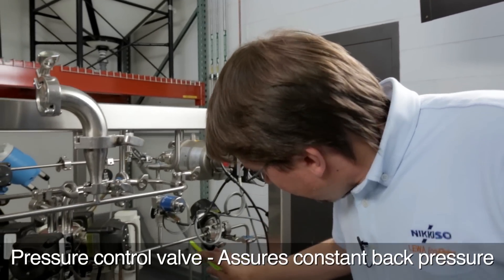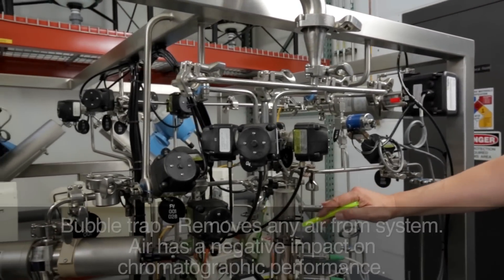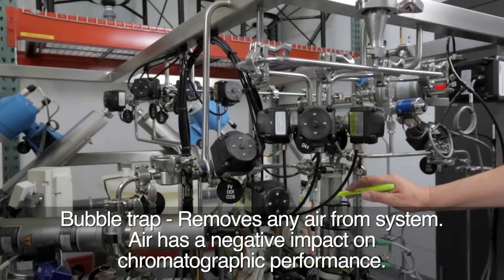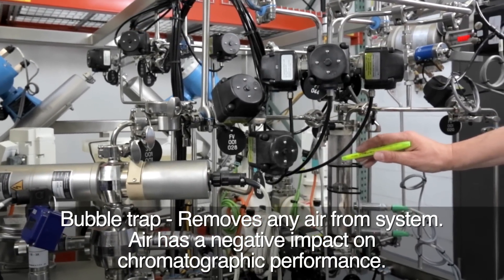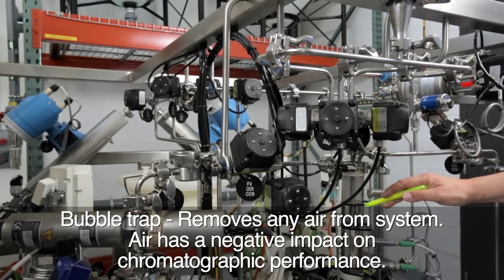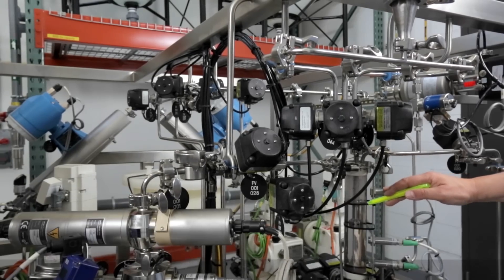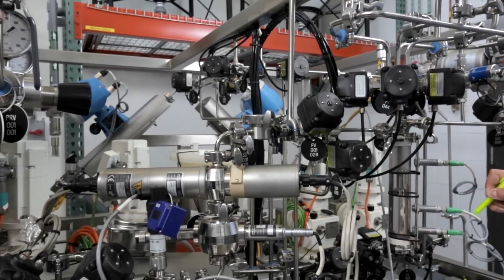After the pressure control valve, there is some piping and then we go into the bubble trap. In the bubble trap, solubilized air in the liquid is taken away to avoid any negative impact to the chromatography itself. In some cases, the bubble trap is isolated — for example, when the protein is sent directly to the column.